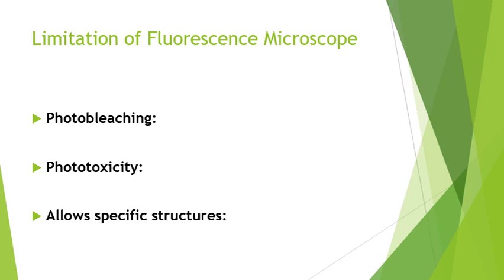The second one is phototoxicity. Phototoxicity frequently occurs during fluorescence microscopy, and its consequences are often underestimated because it causes damage to cellular macromolecules upon excitation light illumination, and can impair or destroy the sample physiology and even lead to sample death.